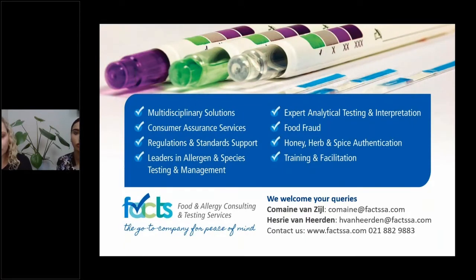So you get a lateral flow device specifically for milk and a lateral flow device specifically for soy. I think the only case where I have seen lateral flow devices for more than one allergen is when it's for tree nuts. There's actually a kit available that detects about 4 or 5 different tree nuts in the one kit. So that's the only situation. Otherwise, you only have the total protein systems where it detects any protein, as well as the lateral flow devices that are allergen specific, except for the tree nut example I just gave, where it does detect more than one allergen, but it's then 4 or 5 different tree nuts. So I hope that answers the question for you.